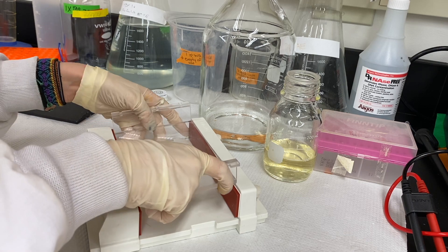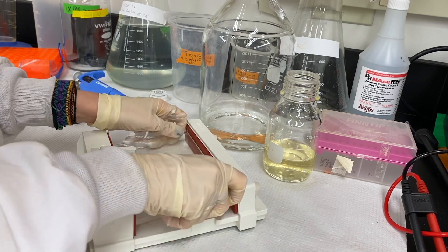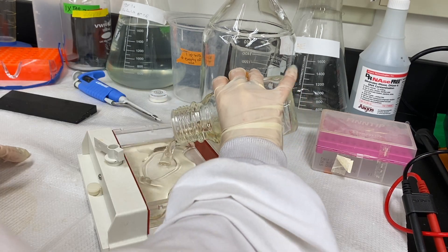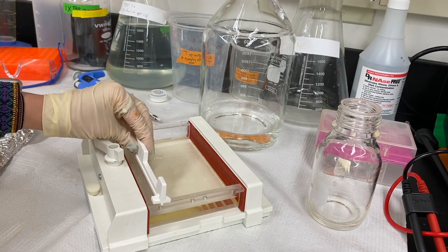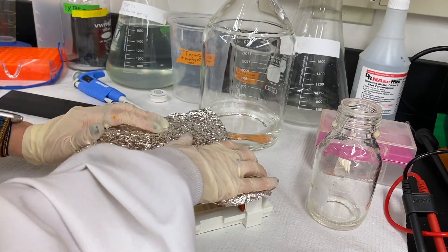Next, I pour the solution into this mold where it will cool for about 15 more minutes until it becomes a solid gel. These prongs are placed in it to leave a hole where DNA can sit once the gel is fully solid.